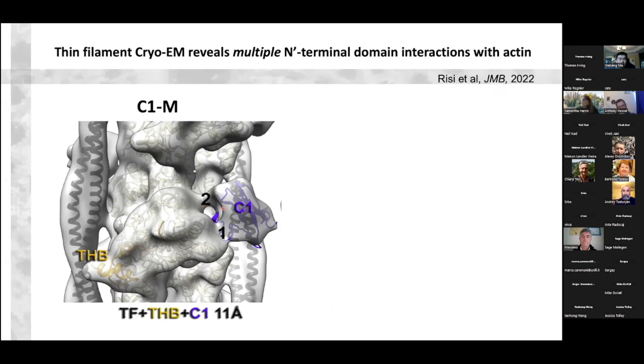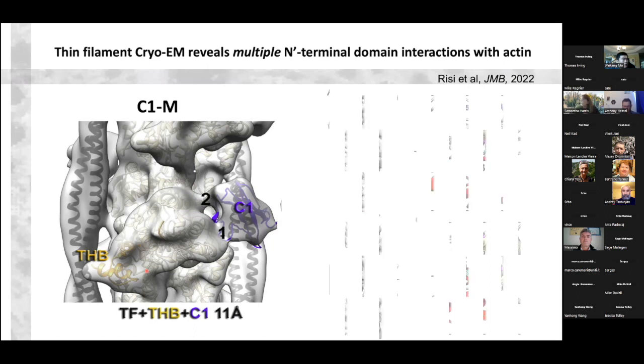from last year, where it shows the C1 domain of myosin binding protein C on the thin filament, as well as a structure called the trihelix bundle of the M domain. And this is a particularly important regulatory region of myosin binding protein C. So we're getting a lot of details from these different cryo-EM approaches. And this has been really quite a revolution and very exciting to be part of this.